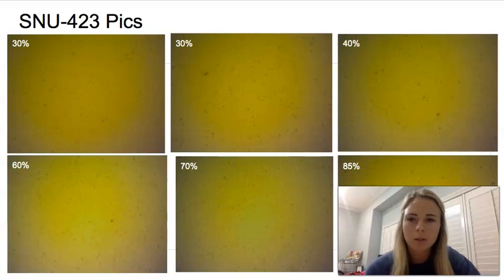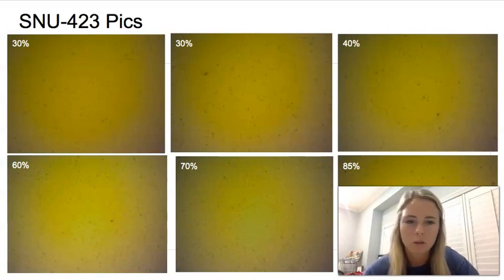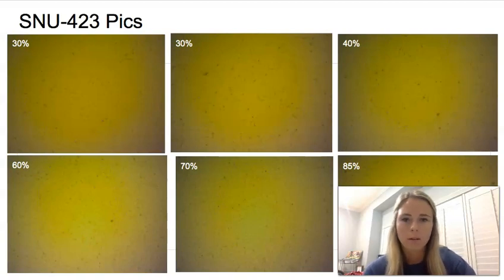Here are some pictures of the cells we saw when we grew the SNU 423. It is kind of difficult to see some of the cells at this magnification — this is the further-out magnification, which is 4X. It's easier to judge the overall confluency at this magnification, though at higher magnification you can see the cells better. You can see the 30 and 40% are very spread out and not dense, and then in the 70 to 85% the cells get very dense.